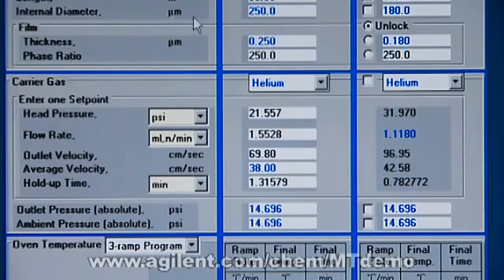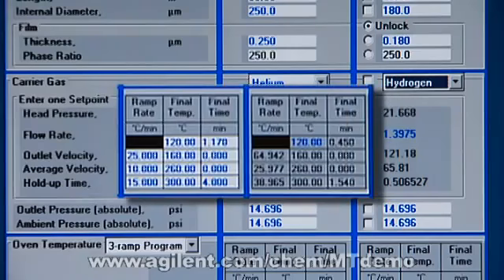So we go in here, we click Translate Only, we click on Hydrogen, we put in our methods, and now we're at under 4 minutes, what used to be a 30-minute run time.